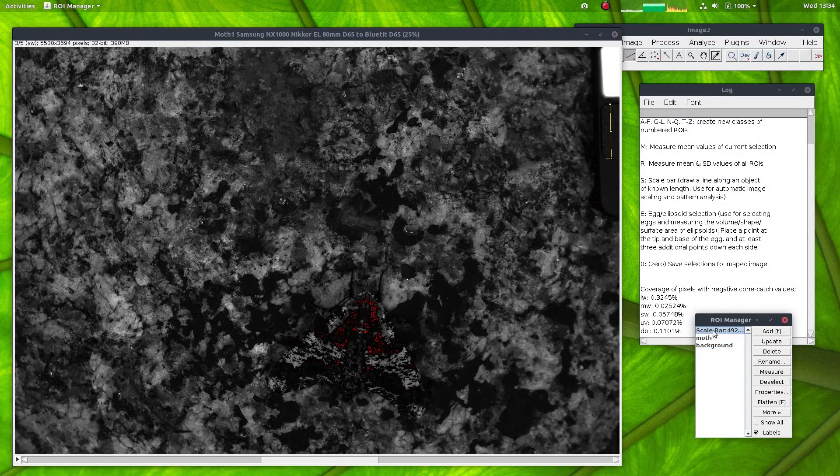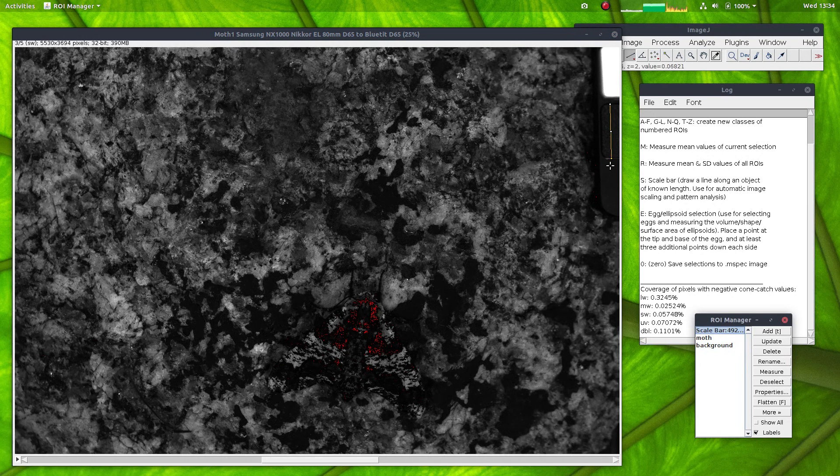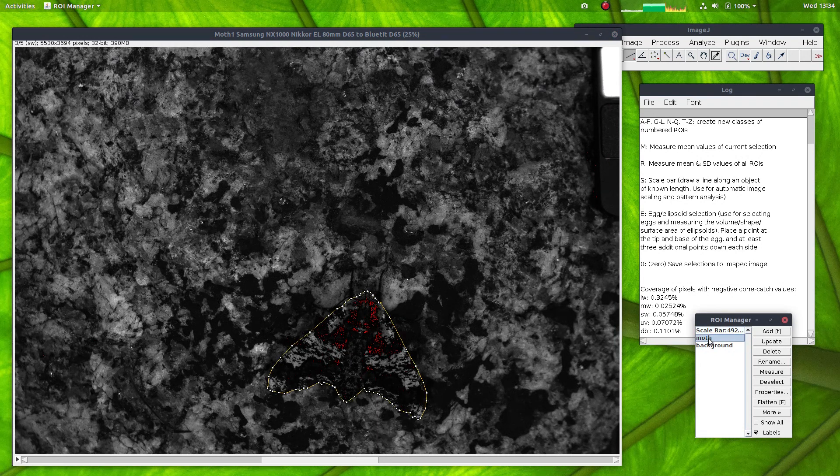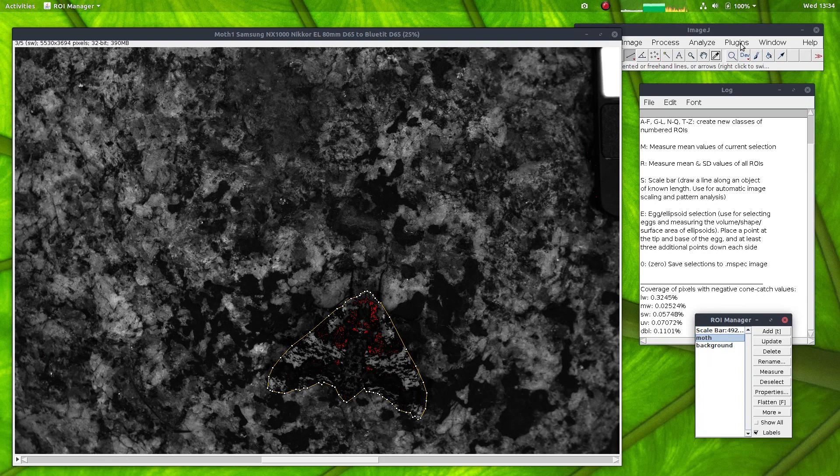I've also already had a scale bar selected in this image. So it's ready to go for the QCPA framework.